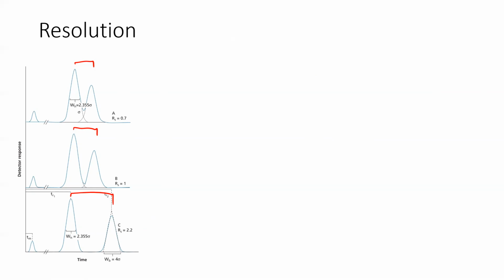In separations, that is an option, but that's a much more difficult option than just taking those two peaks and separating those two peaks in time, right? Because we're separating based on time rather than based on wavelength or mass or something like that, it's much easier to separate in time than it is to actually change that peak shape.